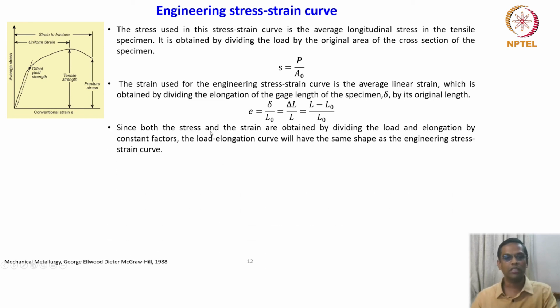Since both the stress and the strain are obtained by dividing the load and elongation by constant factors, the load elongation curve will have the same shape as the engineering stress strain curve.